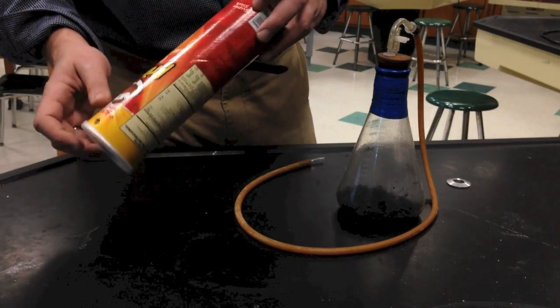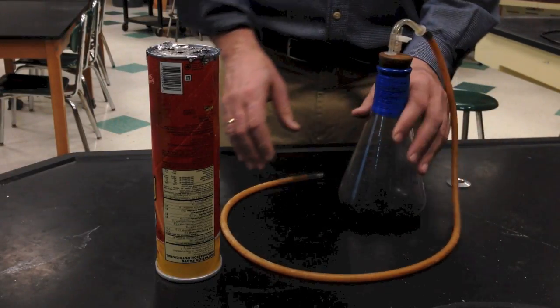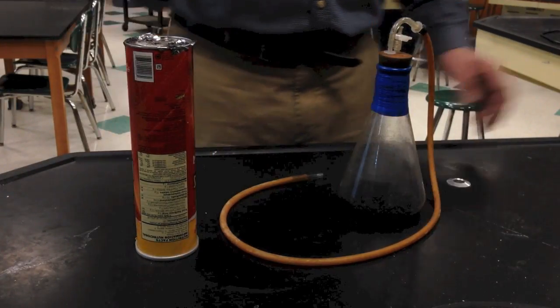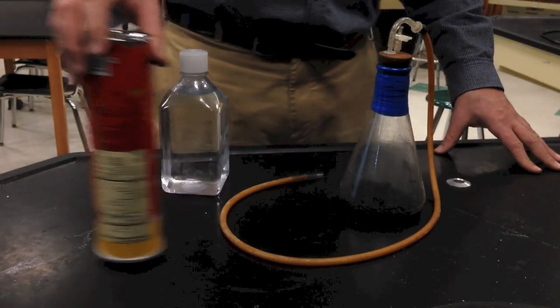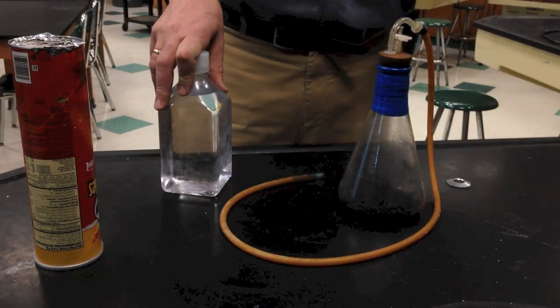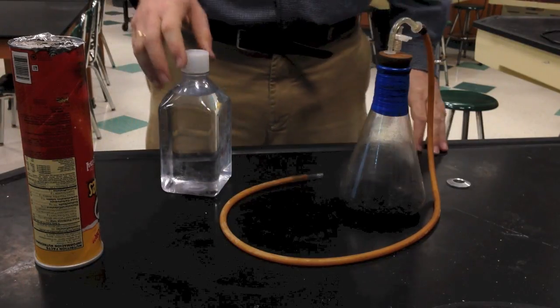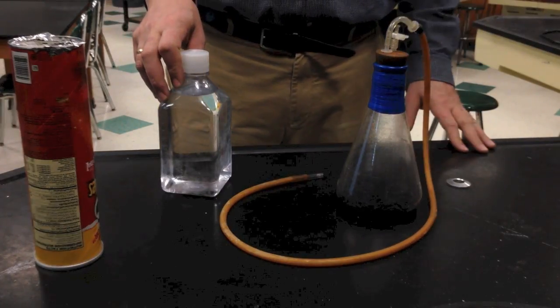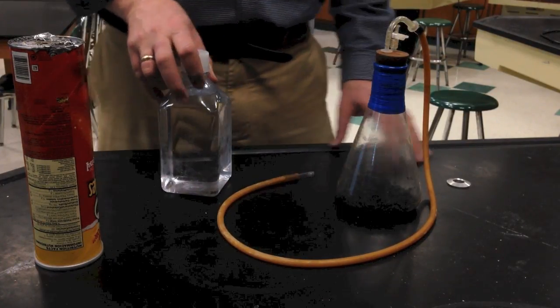hydrogen. So to do so, I've got my hydrogen generator here, which is made of zinc metal, which has 2 valence electrons that loves to give its electrons to H+ ions. H+ ions are going to come from my hydrochloric acid. Acids give off protons, or H+, and H+ are like heat-seeking missiles for electrons. They're small, their charge density is high, and they're +1, and they basically pull electrons away from this metal here. And if hydrogen pluses grab electrons, they become hydrogen atoms. And hydrogen atoms use each other to bond covalently to become hydrogen gas molecules.